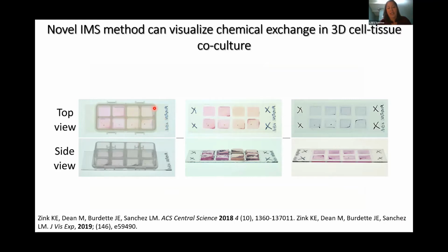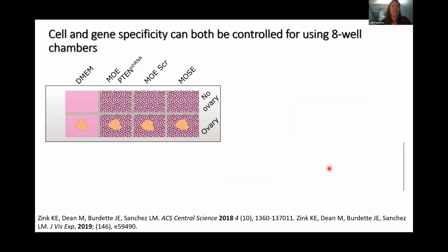So these little 8-well chambers, the trick to this is you just have to release them from the sides using a little spatula. The whole thing just pops right up and off. So you get these nice, even agarose pads. And then just like the microbial imaging, we subsequently pop it into the oven and dry it down. And you can see these dry down nice and flat and are well adhered to these ITO slides. We then coat them with a matrix using a TM sprayer.